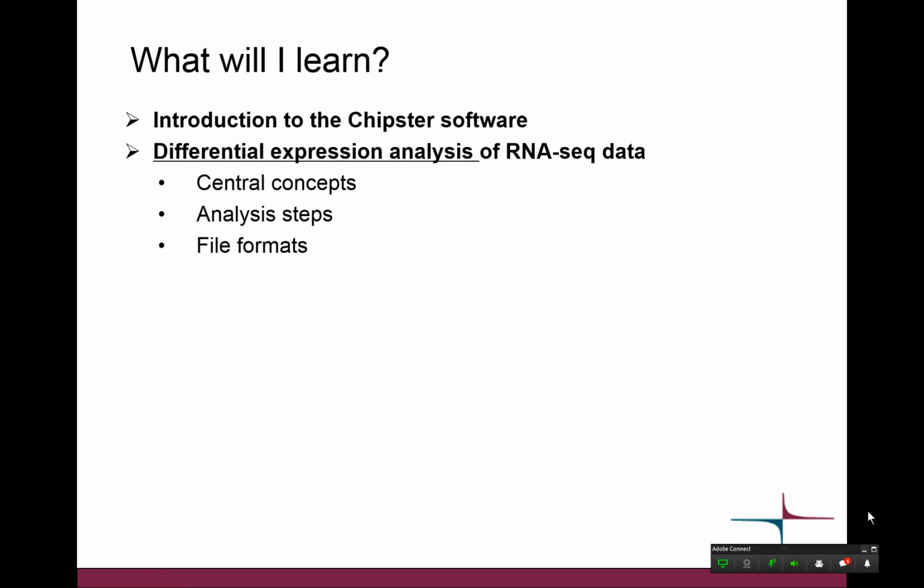Thank you. Okay, yeah, indeed we are keeping the topic very brief, and we are focusing on the main steps of differential expression analysis of RNA-seq data. Usually our courses of this particular topic are like 1 to 2 days, so indeed this is going to be a short introduction kind of presentation.